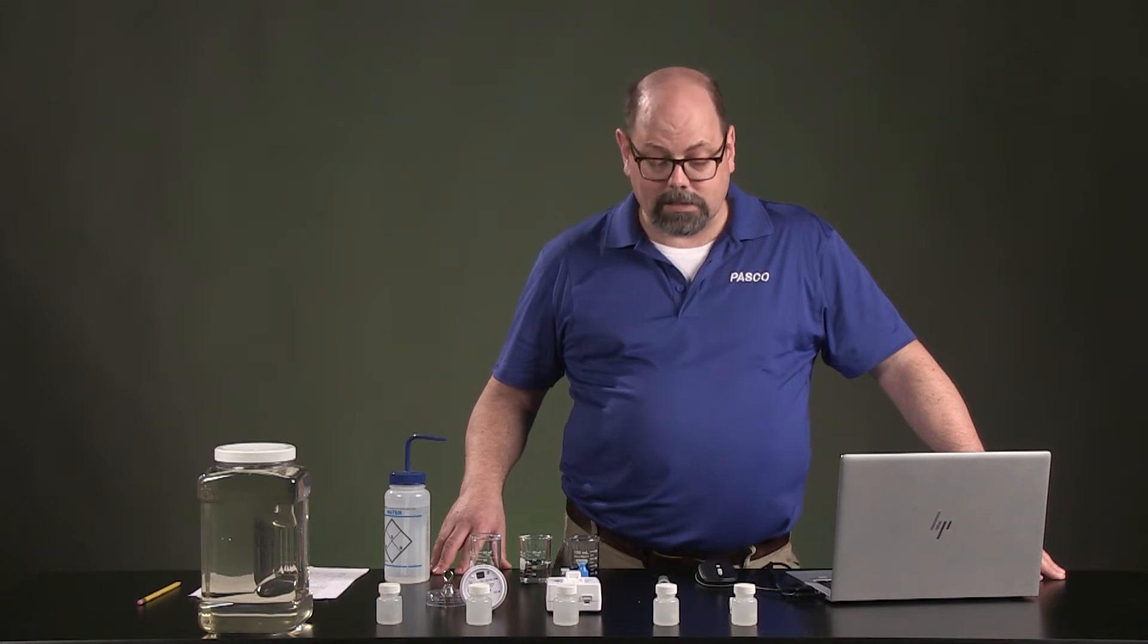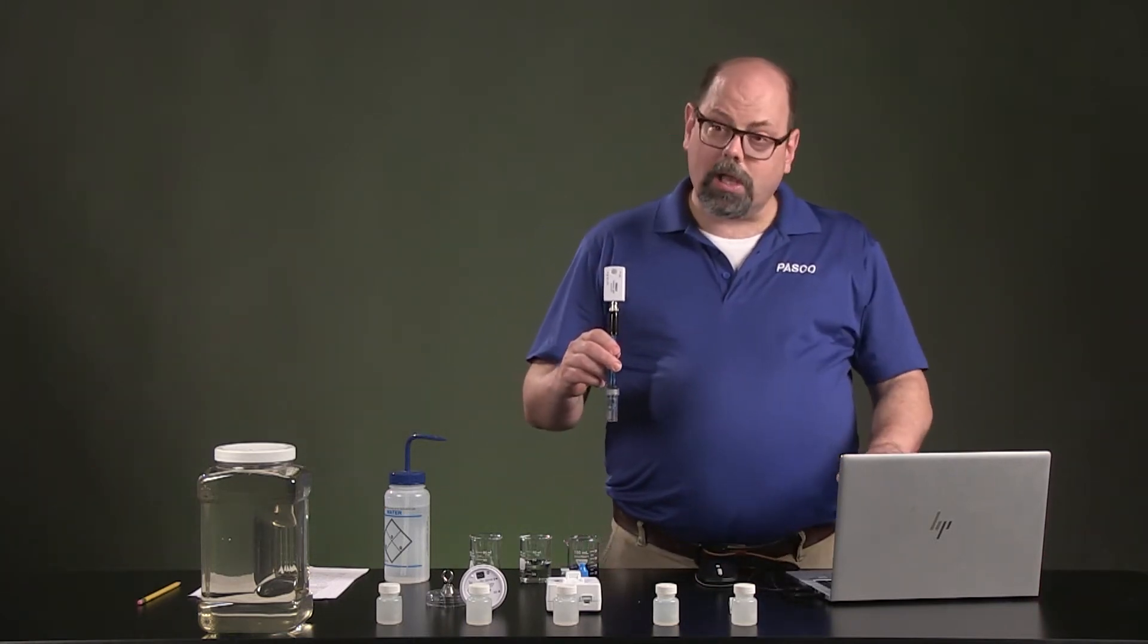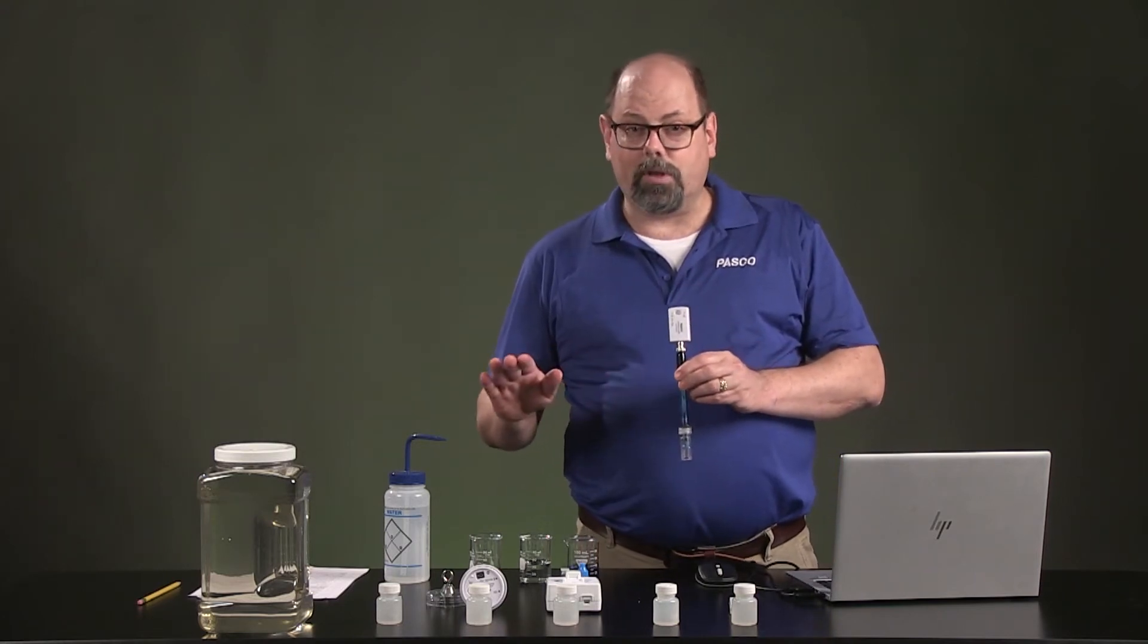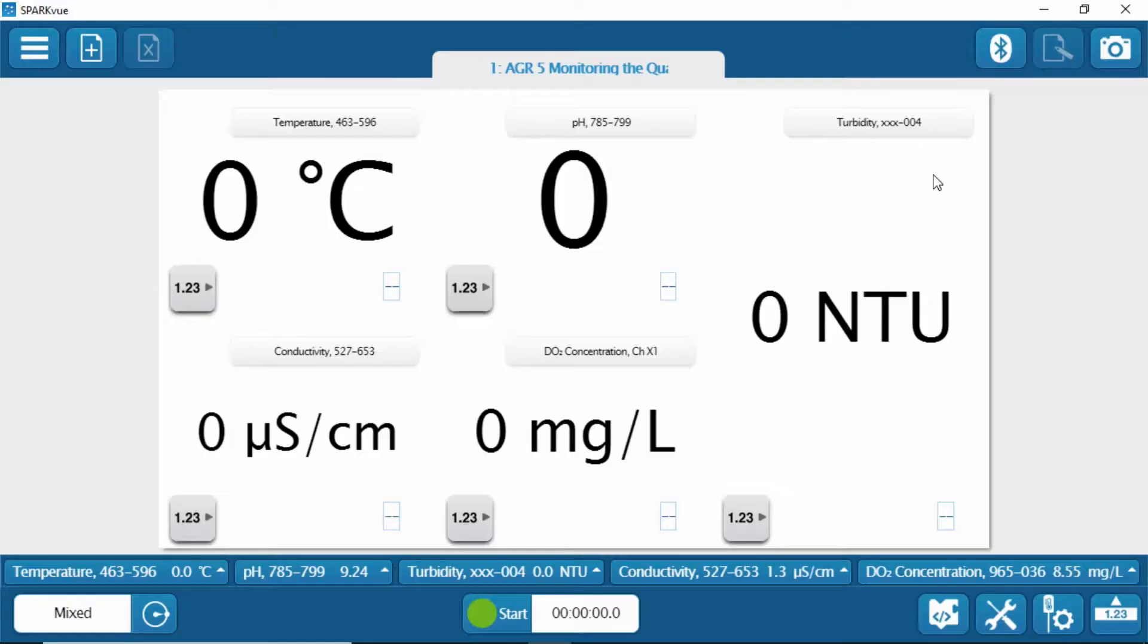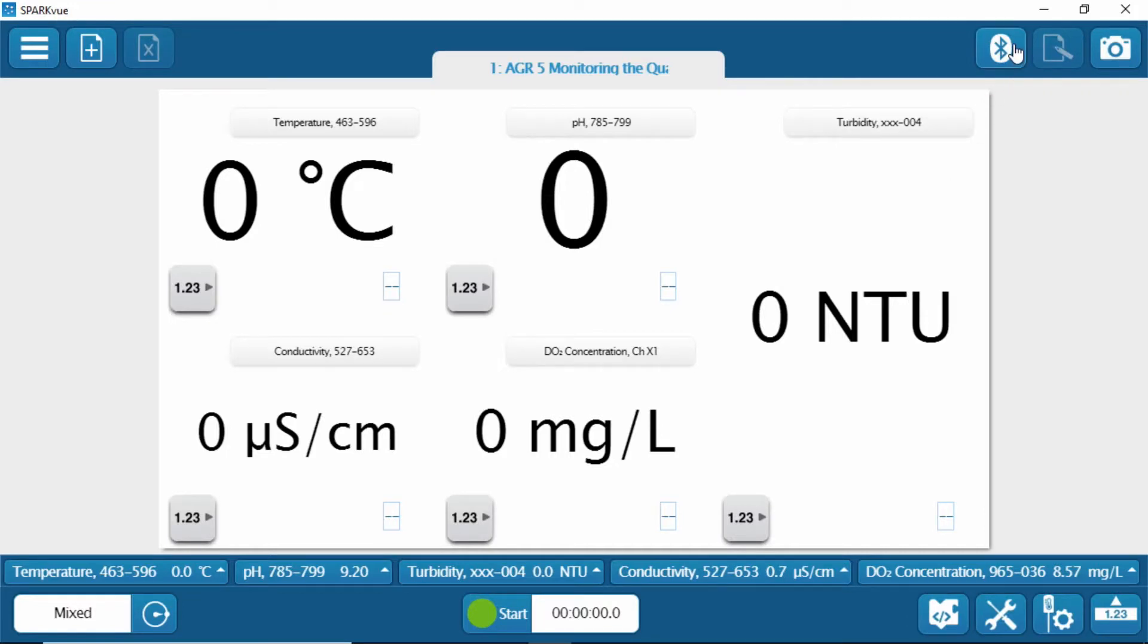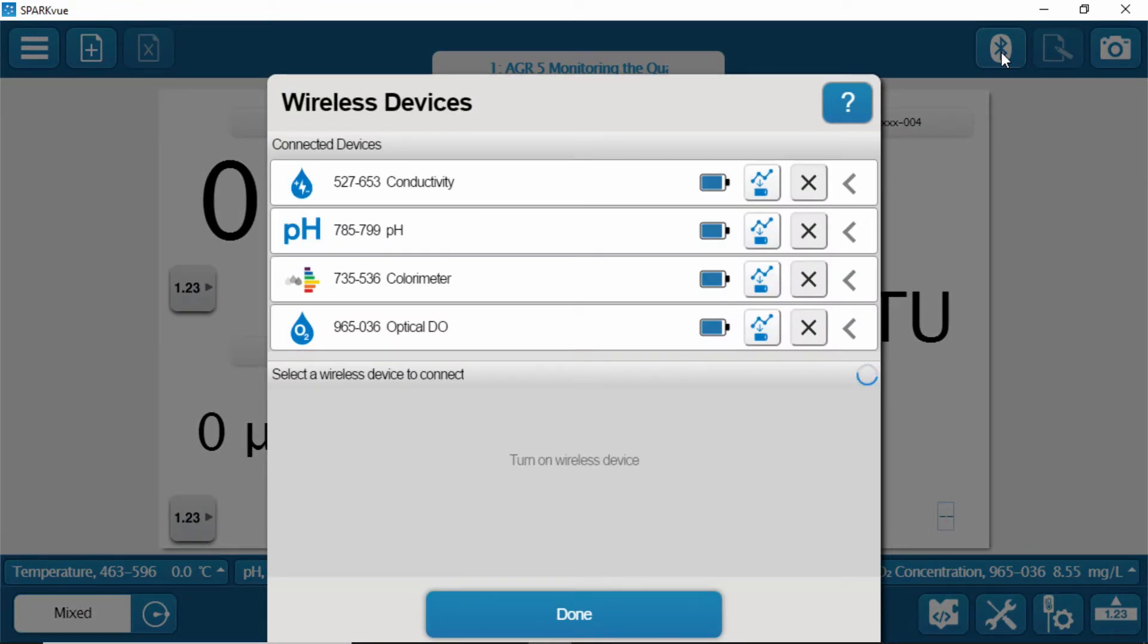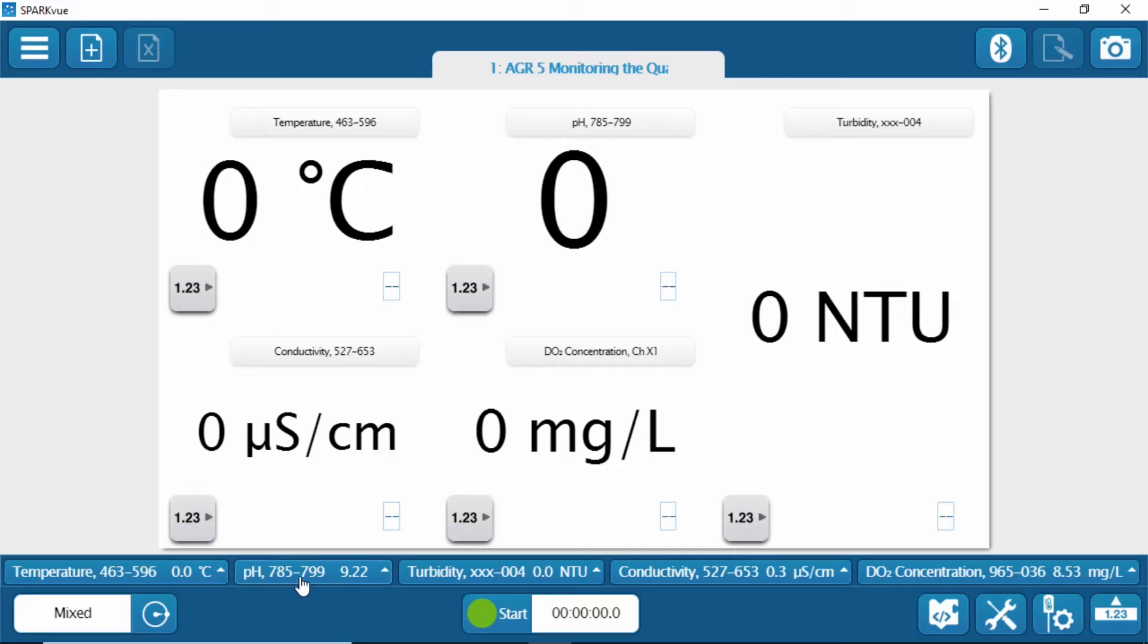Before we do testing, it's important that several of these are highly sensitive. For example, the pH sensor needs to be calibrated, and I'll show you the hookup and how we're going to run this inside the program to do the calibration, and then we're going to run through the quality tests. If you look in your computer, we've got the SparkView file that's going to allow you to have a window into all of these five water quality variables. We want to make sure up in the Wi-Fi or Bluetooth connection area that this particular probe is connected. You can see that this is the pH sensor, it is connected. To make sure that this is calibrated, we want to click on the live display here, and we're going to calibrate that measurement.